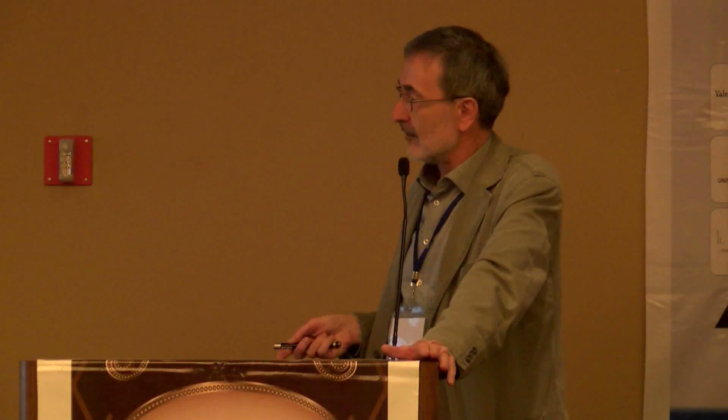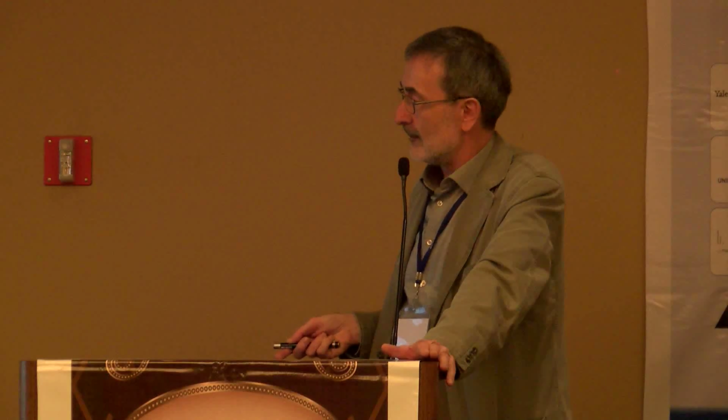This is the workflow. The laser, the instrument, is first used to mark the track. Then the laser is cutting, and this is the dissected cell, and this is the hole remaining after the cell has been cut. In this case it was a quite large cell, so it is not a normal cell. The diameter of the cell is 60 to 80 micrometers in some cases, and it was sufficient to collect around 8 to 10 cells in order to receive very nice NMR spectra like this with a good signal to noise.